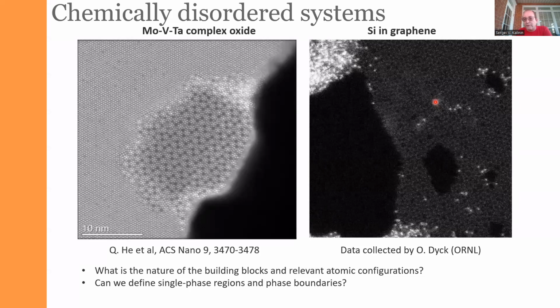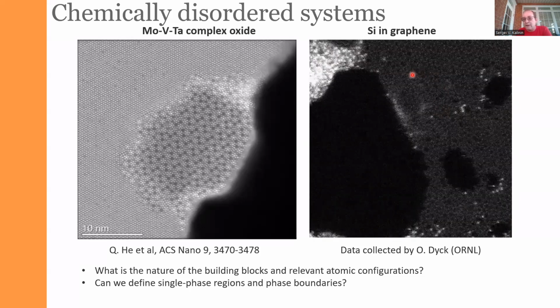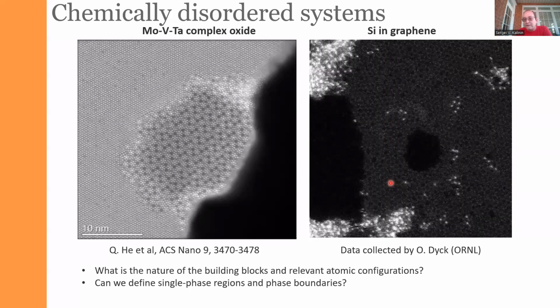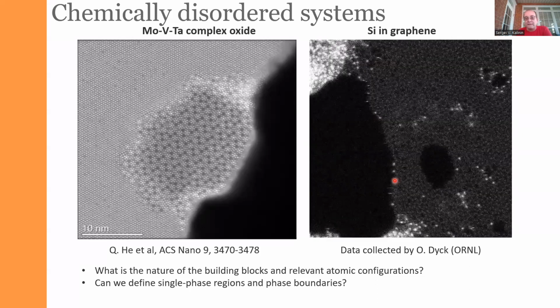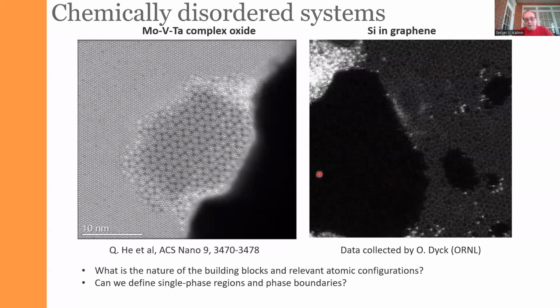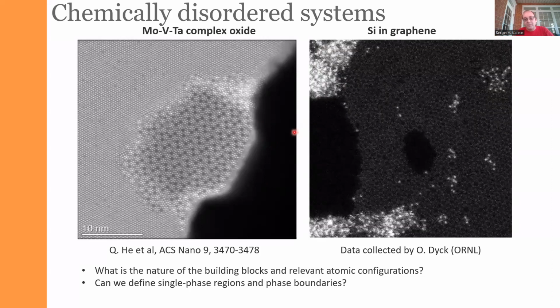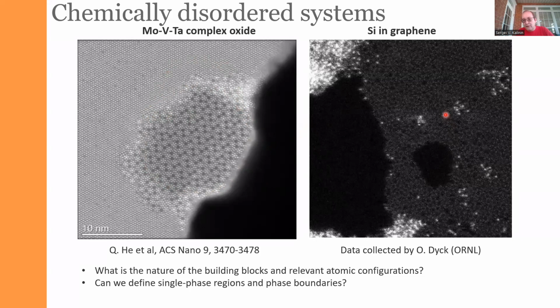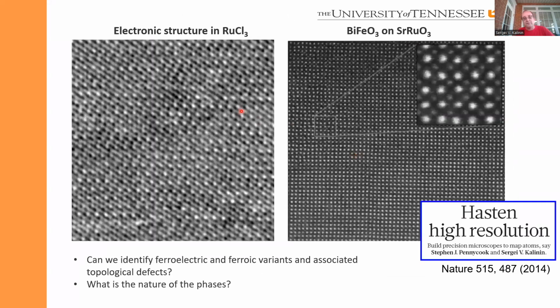It actually undergoes the beam damage. So you see how the defects form, and the whole thing slowly falls apart. But again, the question is, can we identify the individual defects and building blocks inside this graphene which undergoes this transformation? So you can say that in this case, the human eye can be a pretty good guide, for we can clearly differentiate this phase and this phase. In graphene's case, it would be a little bit different, but let's look at a more complex example.